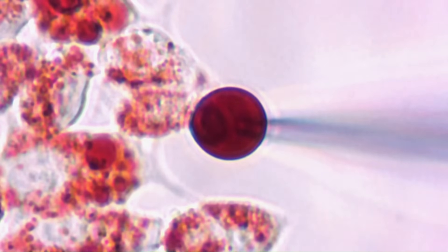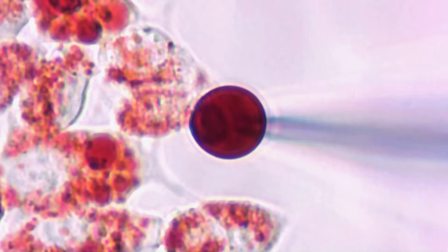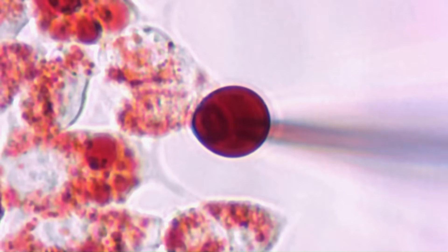Once a gigaseal has been formed on the lysosome, a ZAP or voltage pulse is used to break in and achieve the whole lysosome configuration. This can be confirmed by observing the red dye from the lysosome leaching into the pipette as the intracellular solution of the pipette dialyzes with the lysosome on the lid.